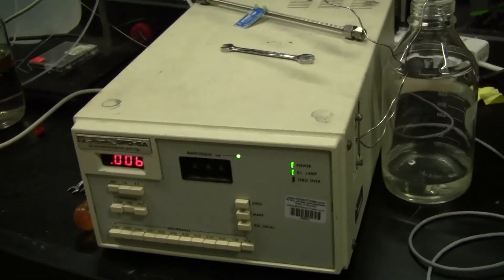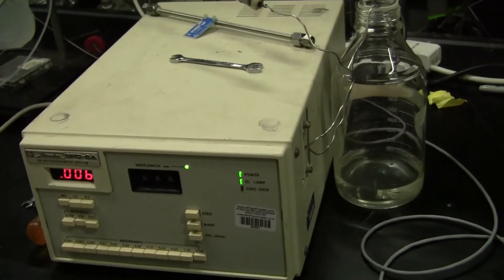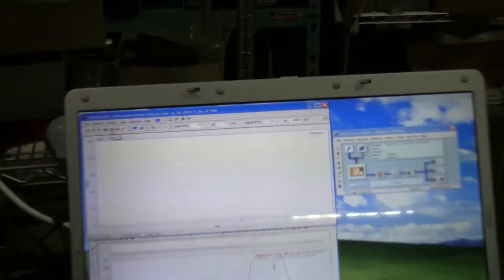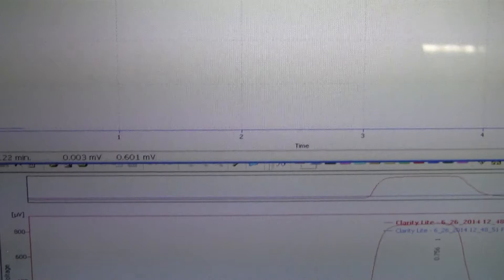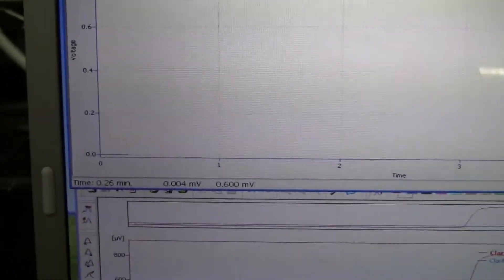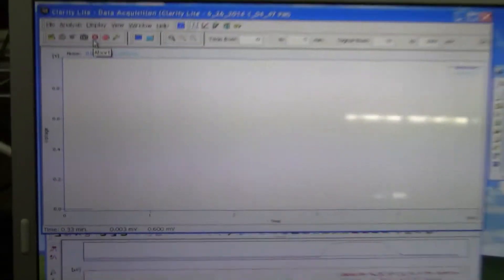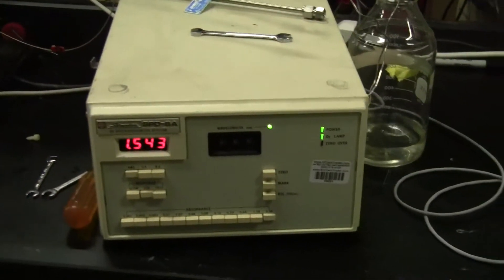As you can see, we're going to be looking for the output on both machines. A little bit of a run down there. Oh, and there goes the peak.